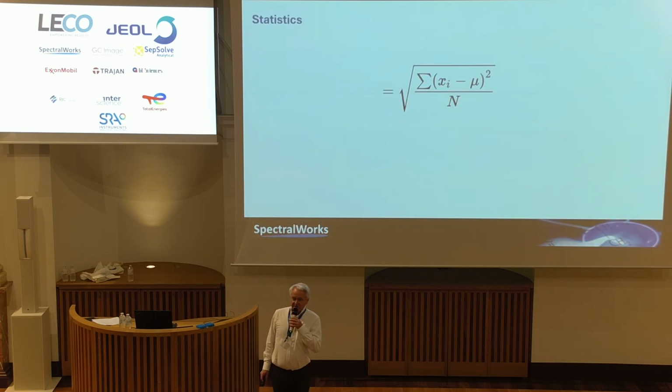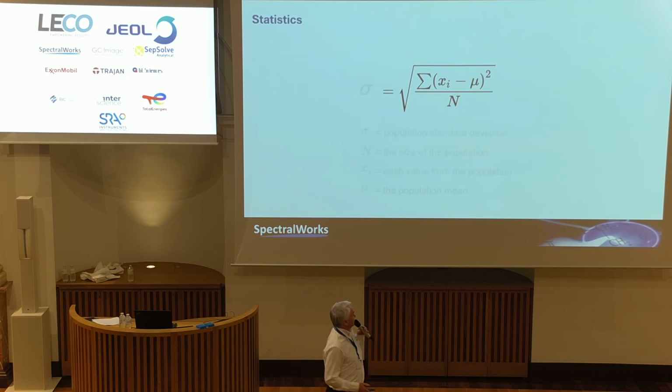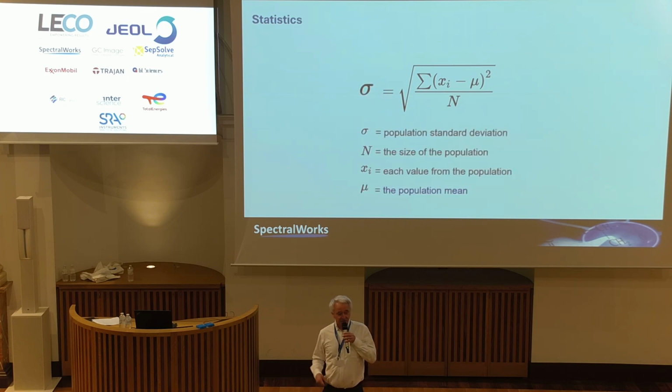Statistics, audience participation. Raise your hand if you know what this is. Okay, actually quite a small number. It is, of course, just a simple calculation of standard deviation. The vast majority of people here accepted it and accept it today for what it is. We don't have to worry about statistics. Statistics have become commonplace now.